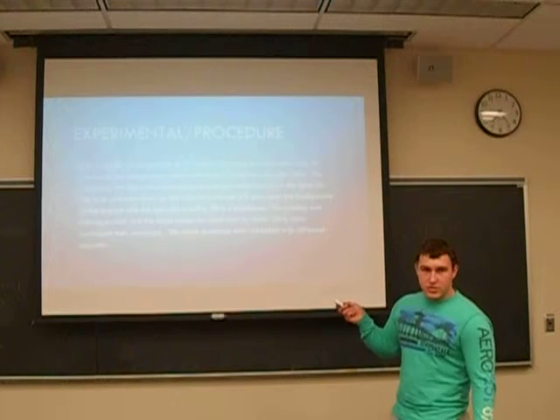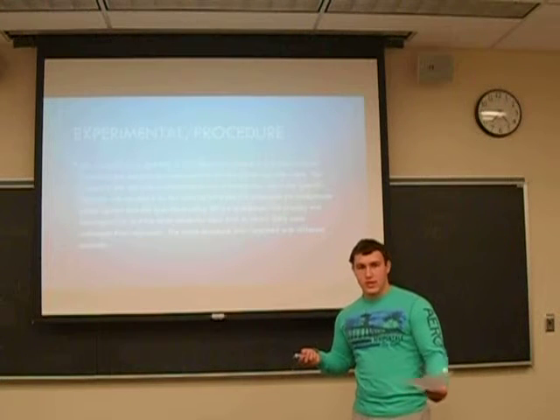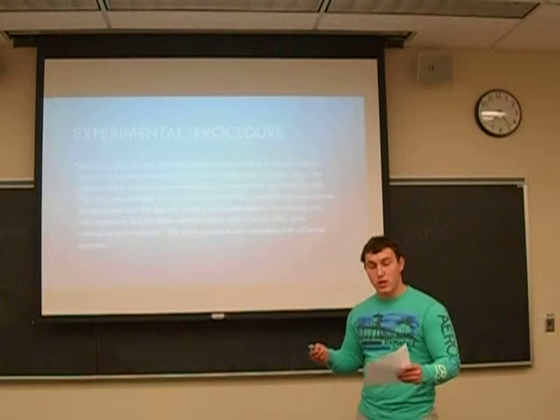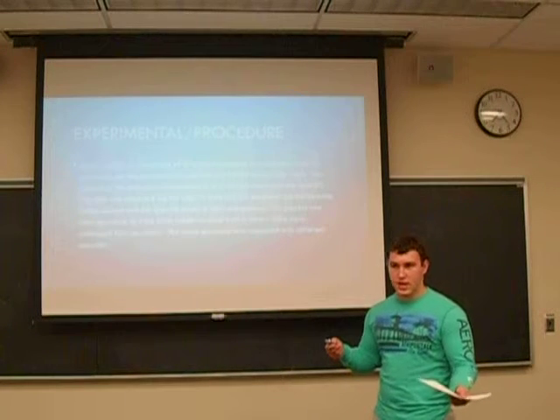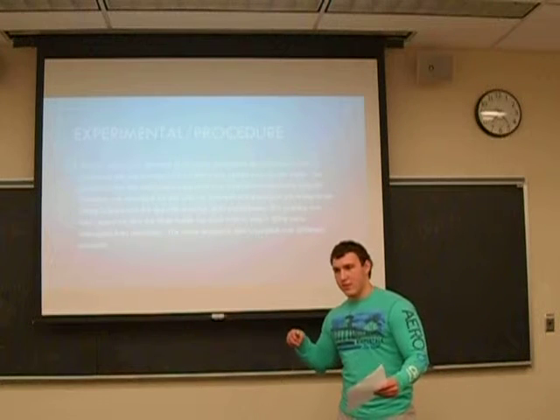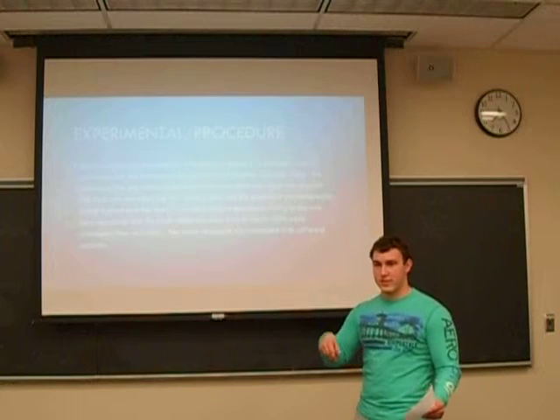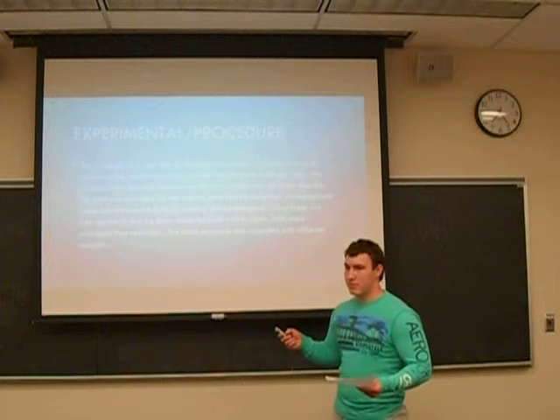So the experimental procedure is pretty much what I said earlier, but to go a little bit more in detail, you start out with the DI water, and then you measure out the OA, or oxalic acid solution, and you mix those together. And then you would go to Dr. Jean, and she would drop your potassium permanganate. First you start the stopwatch, you spin it until it turns purple, and then you put it in the Spec 20. And once it reaches 30%, you stop the timer and you record it.